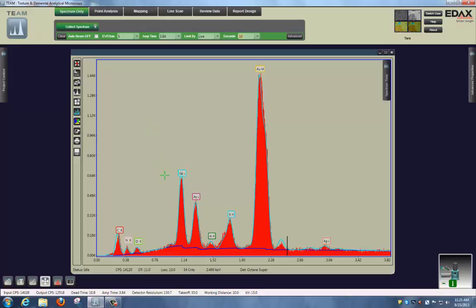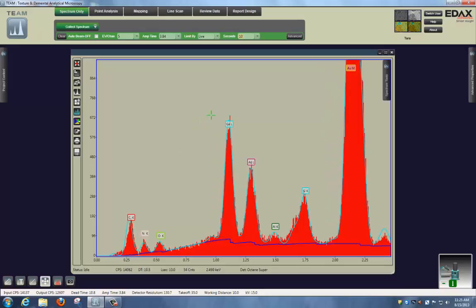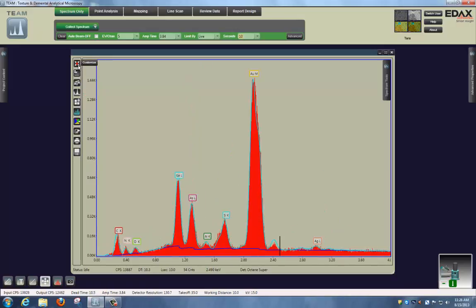I can also right mouse click and drag and move up and to the right. Or I can left mouse click and drag to define a box or an area for my analysis. And to bring me back to my custom home view, I just click on the icon. The next icon is going to apply element ID. Expert ID is used whenever the spectrum is collected, and it automatically puts the labels up on the peaks, but you can click on that icon to redo it anytime.